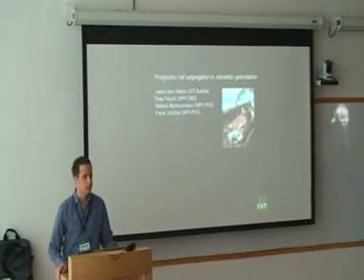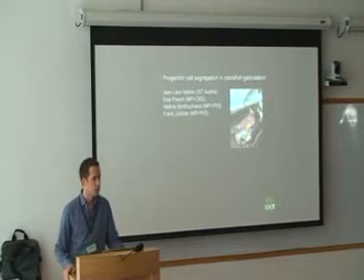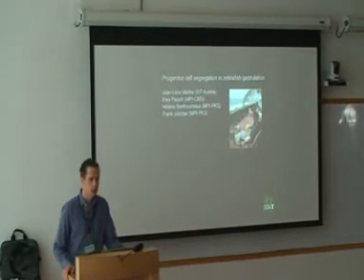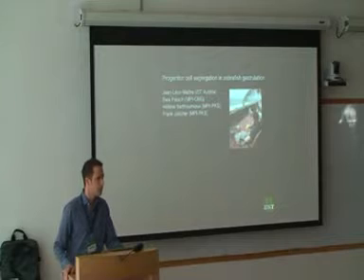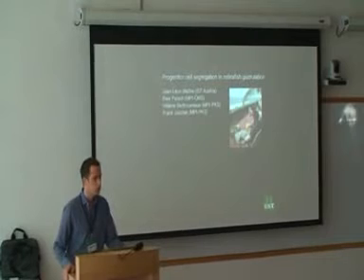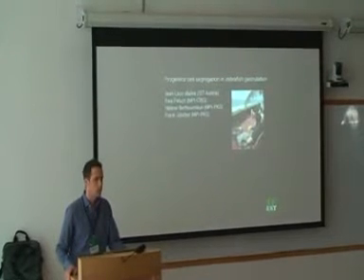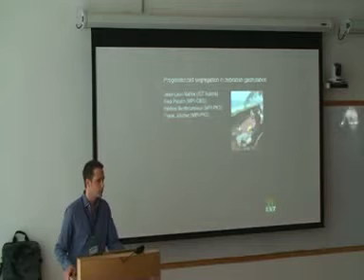So what I would like to do is give you a little scientific presentation about a topic we have worked on, which is cell sorting in gastrulation. I will speak about that specifically because, for analyzing cell sorting, we have used micropipettes. It gives you an idea of what you can do with pipettes if you're interested in analyzing mechanical and adhesive features of cells during the sorting behavior.